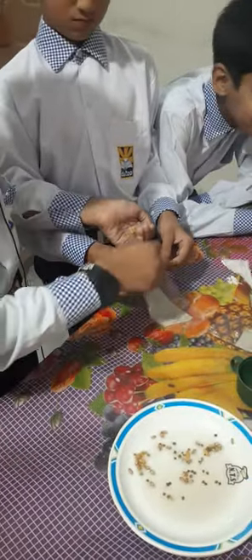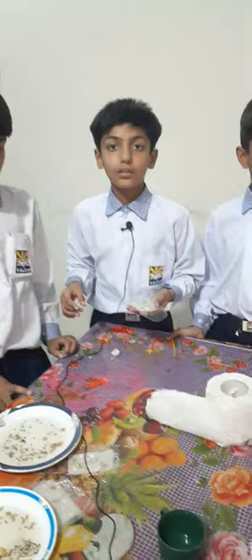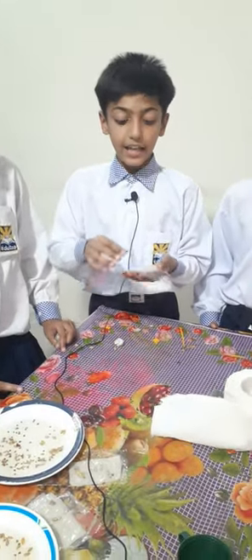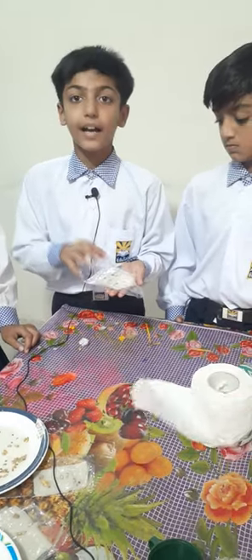We will place the seeds in the paper towel and seal the plastic bag. After 3 days, the seeds should begin to germinate.